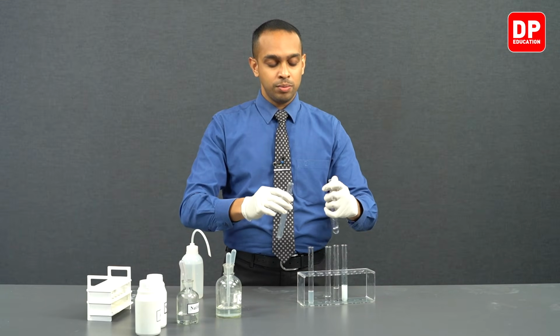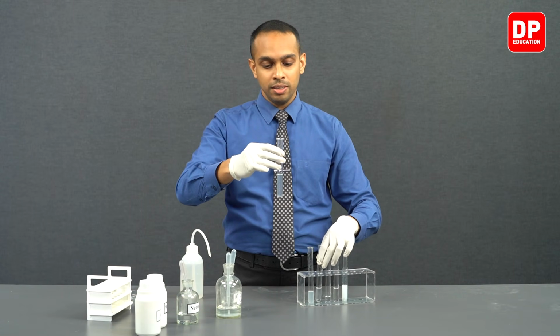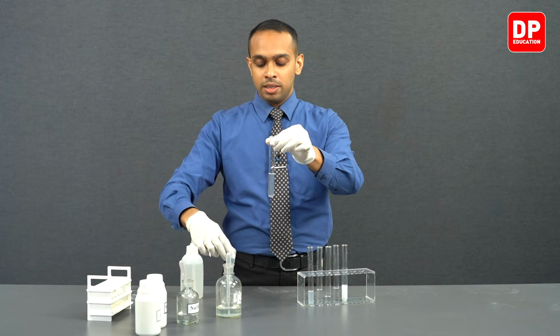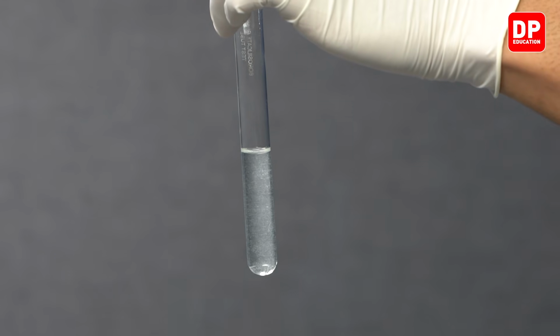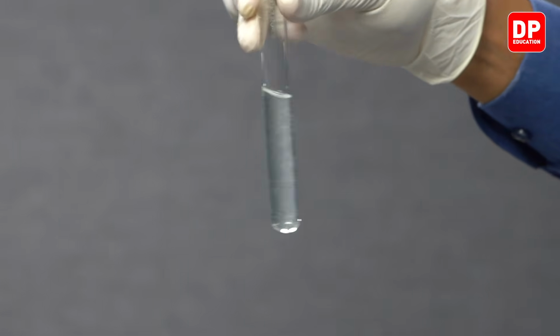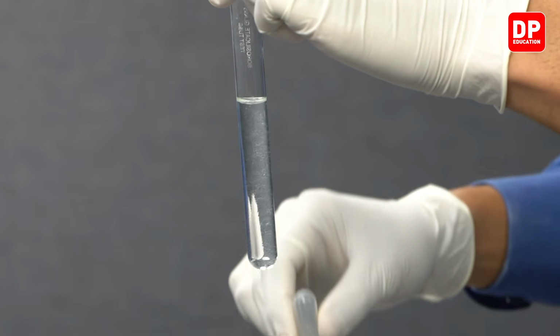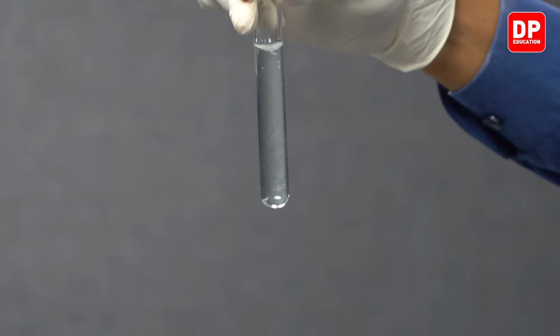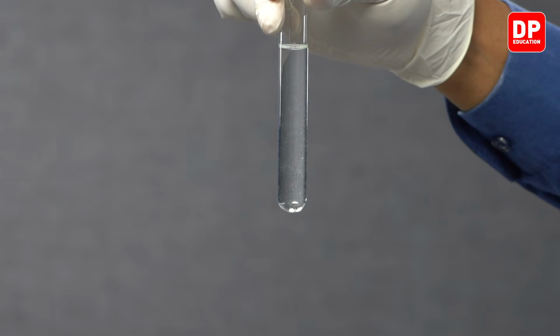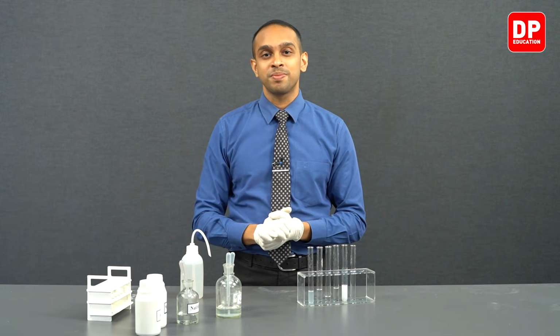We'll transfer some to another test tube so that we only have a small volume to handle here. So now we are going to continuously add HCl, and you can see as more and more HCl is added, that produced aluminium hydroxide dissolved completely in the HCl that we added into the medium. So this very clearly indicates that aluminium hydroxide is an amphoteric hydroxide.